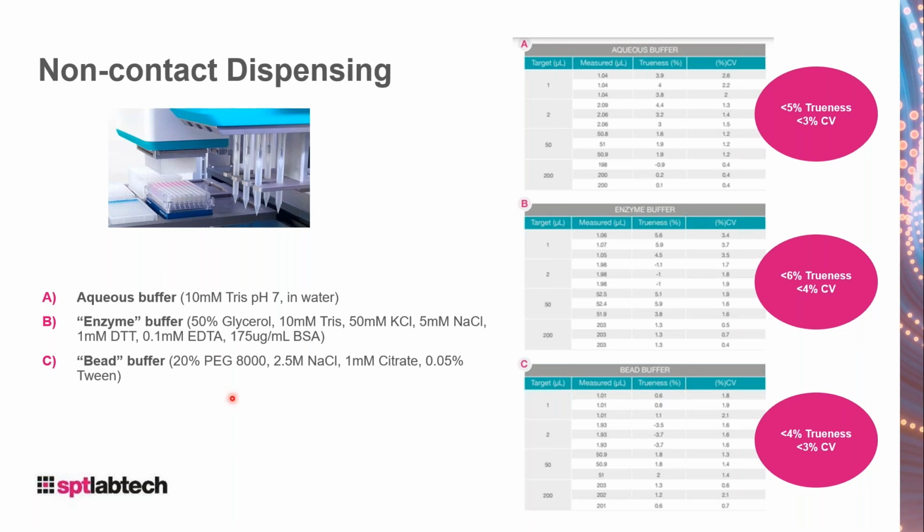So in a similar way to what we did before, these dyed reagents were dispensed and we measured the tartrazine absorbance and related that dispense volume back to a standard curve. So we looked at a range of different volumes and we actually performed either 384 individual dispenses or 96 individual dispenses, just depending on the target volume we're looking at.